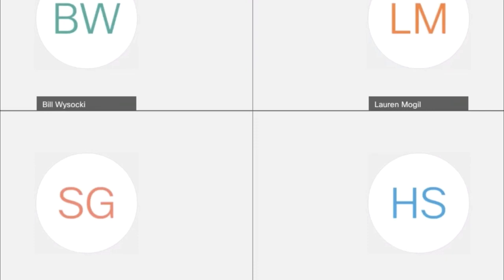The first question is: is there a way now or in the future to download for each sample the FASTQ files in order to perform, again, the mapping process with a different mapping tool? So that's a good question. The GDC doesn't actually provide FASTQ files. We only provide aligned reads files.